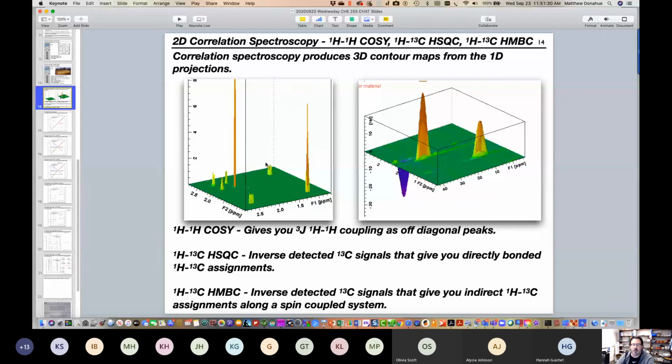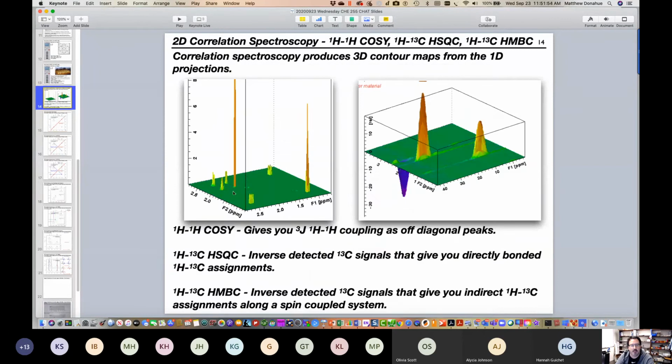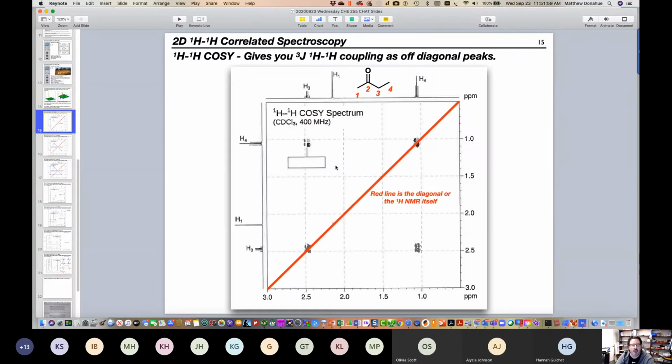And if you know what a contour plot is, imagine you're flying over these mountains, but then you're looking down. When you look down on the mountains, you don't see the height, you see the contour. And so that's what this plot here is, a contour. See how these peaks have height, but when we look here, they don't. If this slide was in color, they would have different colors and it'd be a contour.